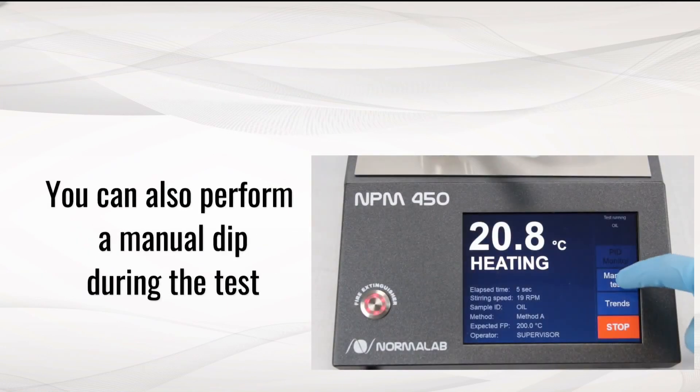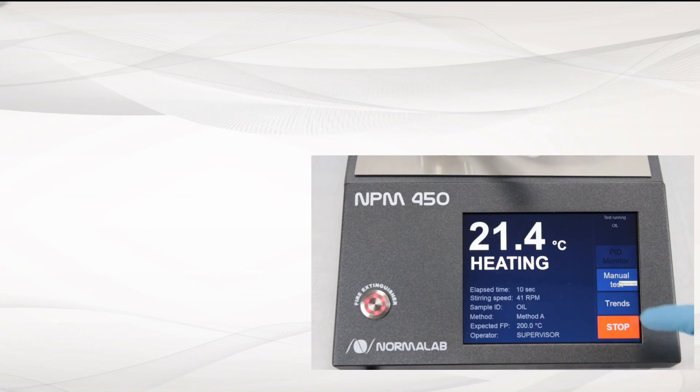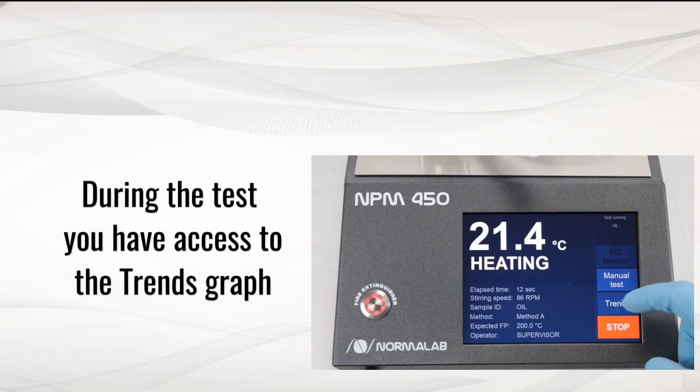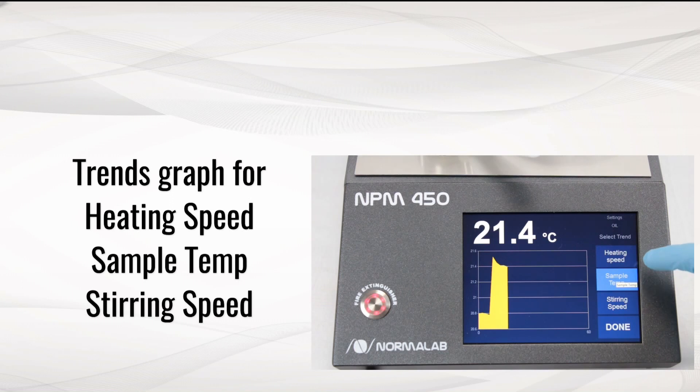You can also perform a manual dip during the test using the manual button. You can follow the heating speed, the sample temperature, and the stirring speed.